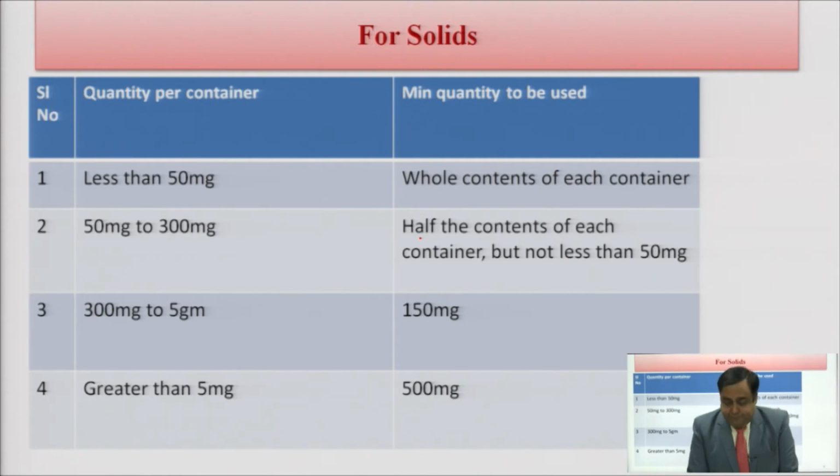Depending on the final amount which is present in the container, we have to select the minimum quantity to be used during the test.